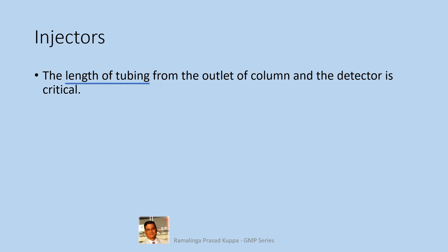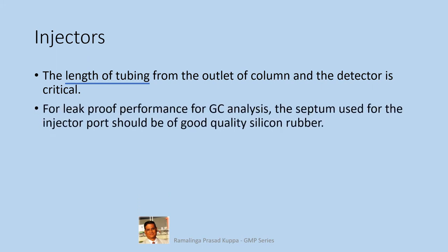Make sure that there are no leaks in the inlet or outlets. This can be achieved by gentle roll-on type ferrules. Never tighten too much. It may break inside the column, making the column unsuitable for further use. Gently fix with fingers. Even if it leaks, remove the connection and reconnect again. You will be successful.